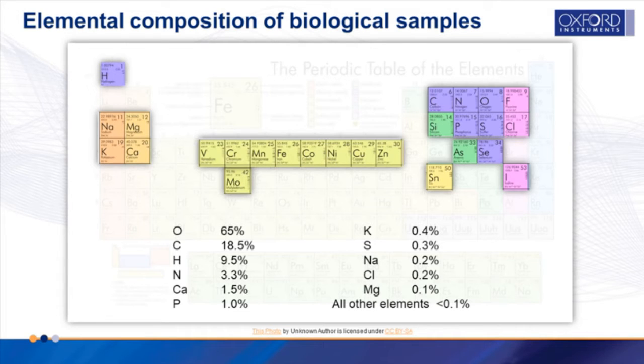One of the key features that can prove problematic for EDS is the relative abundance of each element and whether it can be detected above background noise. The concentrations of various elements in humans are given in the list towards the bottom of the slide. This is a general list encompassing all tissues. Elements may have different concentrations in different tissues and within tissues, cells and organelles. Research in this area is still very limited, and there is much we don't know about elemental localization at the ultrastructural level. There is still no complete list for elements in a single organism.